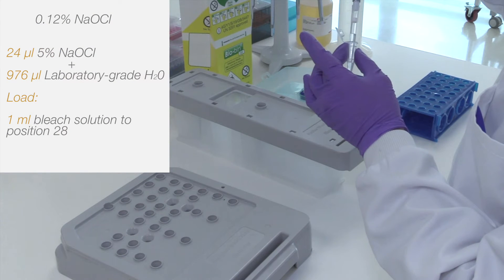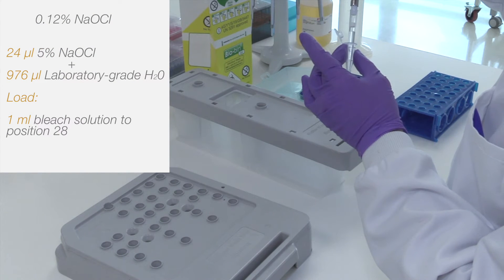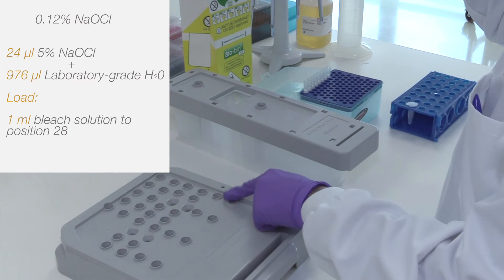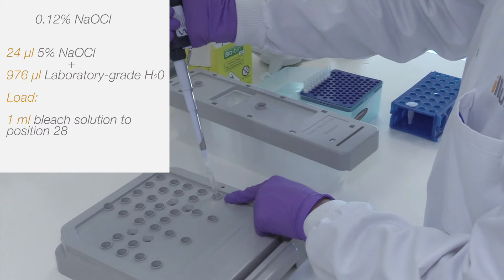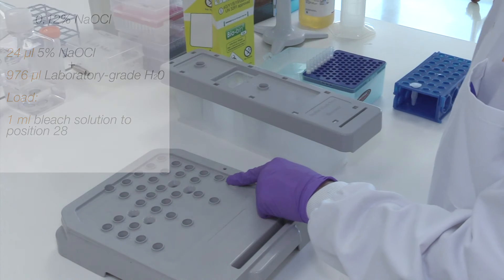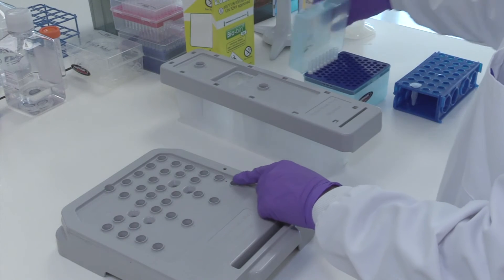Then prepare a 0.12% bleach solution by combining 24 microlitres of 5% bleach and 976 microlitres of lab grade water. Load 1 millilitre of this solution into position 28 of the wash reagent cartridge.